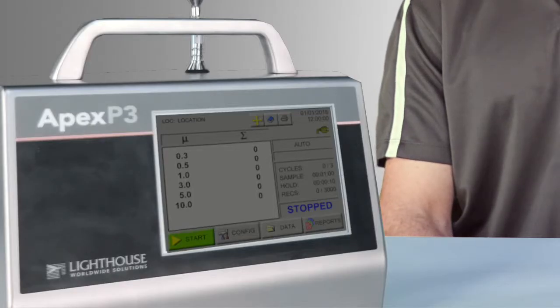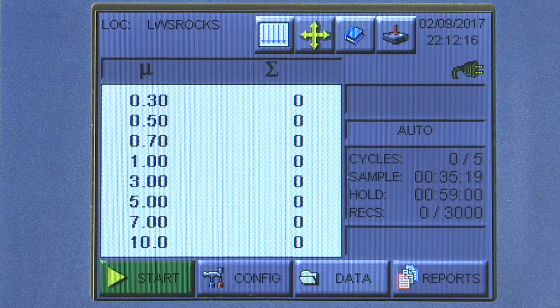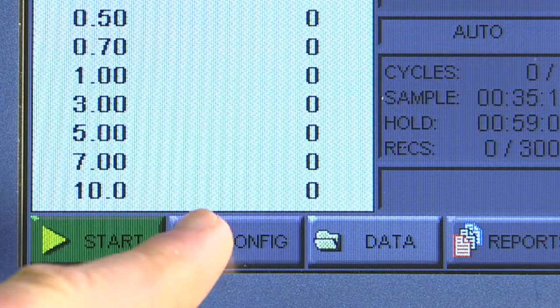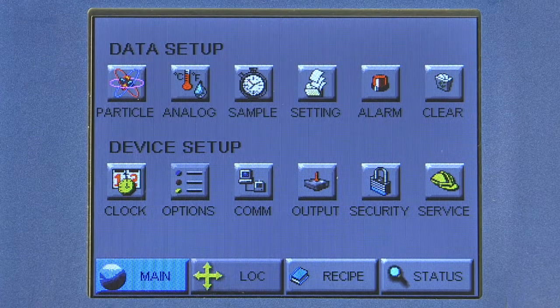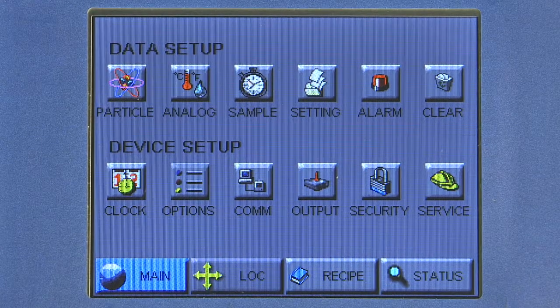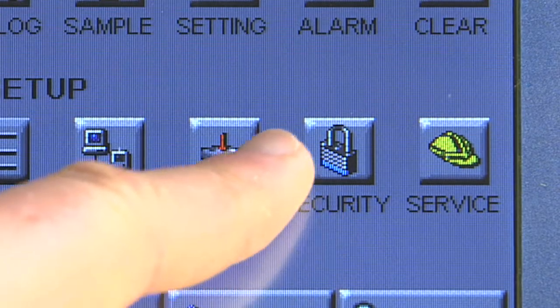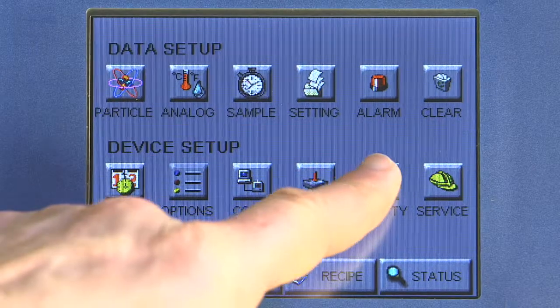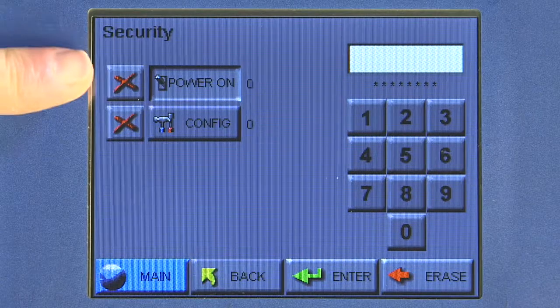Let's get started. Step one, we want to go into the configuration menu. I'll hit the configuration button and then we're going to go into the password menu, which is shown here. In the security section you can see the padlock — let's hit this button.